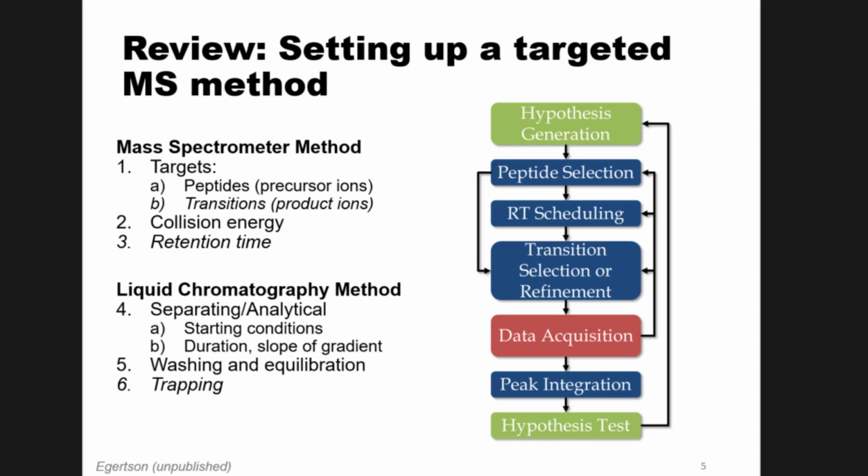We talked about retention time, that liquid chromatography system that we like to ignore in LC-MS, and how important the liquid chromatography can be in our method development. And then I had given you some slides that talk about modifying your liquid chromatography gradient for separating versus washing.